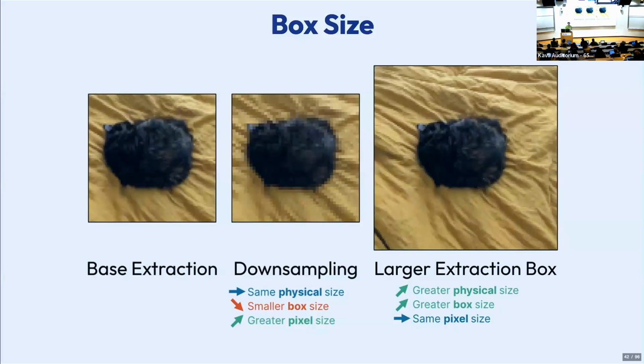How fast do I want this to be? What's my final quality of my map going to be? Like I said, generally people do twice as big as the particle for the box size. And then how big you downsample to will depend on what you're doing. Early stages, I often downsample to 128 pixels, kind of no matter what I'm doing. And you can go even further than that, although you may not want to.